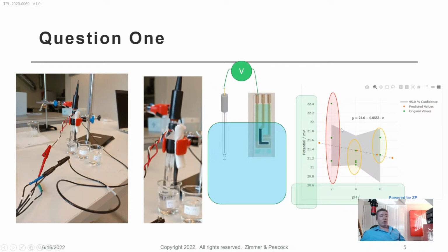These are actually very small distributions in values. If anything, it says what a good reference ours is, because this is essentially made up of 9 reference electrode data points, and they're all looking pretty good. So I think it's fair to say that we don't have a pH sensitive silver chloride electrode, which is what we would expect. But I think in reality, you sometimes have to actually test things, because in experimental science you discover new phenomena that you weren't otherwise expecting, but we have tested it.